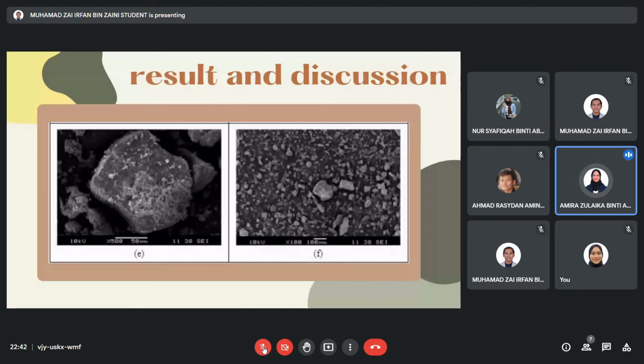The figures show that there are some properties that we can identify, such as the presence of visible pores and an uneven surface. The production of pores in the alloy is mostly due to the formation of a surface layer with the emission of gases such as hydrogen, whereas the external morphology is what reveals the uneven surface, which can be considered as texture on the surface of the sample. Next slide.